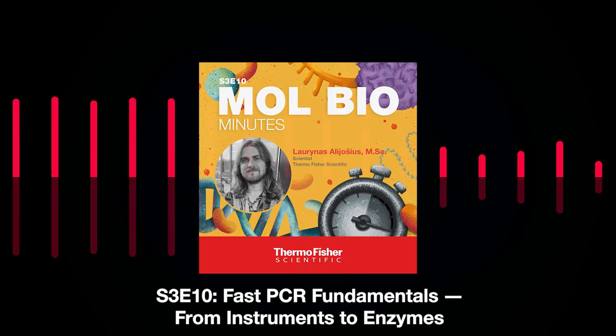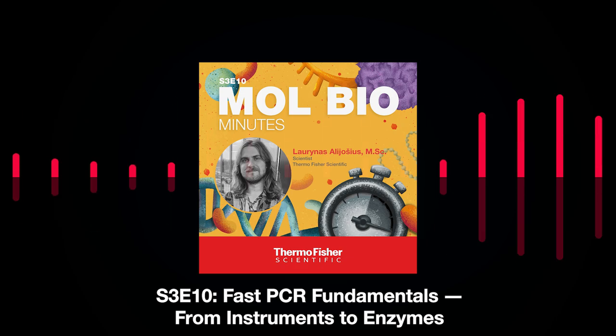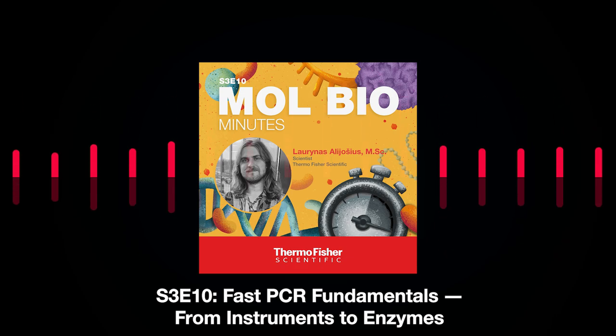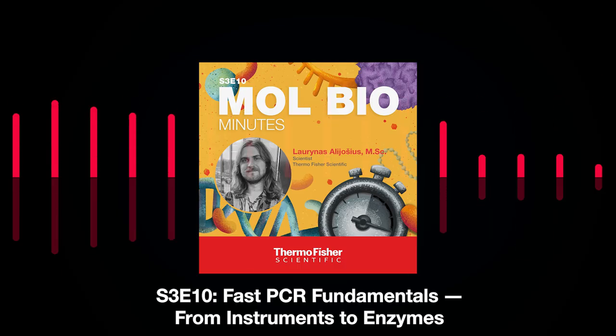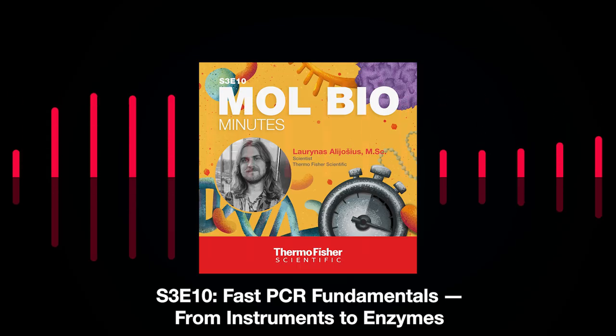But let's say if you have a lot of DNA material, then you can lower the number of your PCR cycles significantly, even down to 25 or even 20 cycles instead of the standard 35 or 40 or 30 cycles. If you have lots of template DNA, this could be the way you can make your PCR faster.